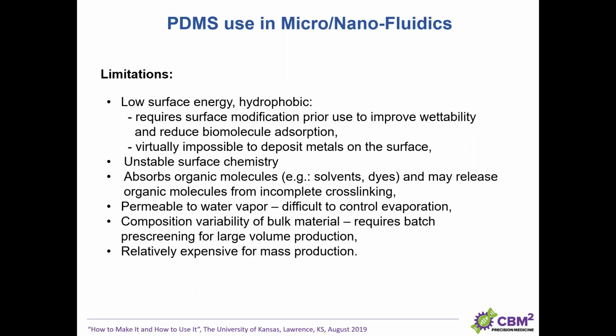It is permeable to water vapor, so in the previous slide I gave you this as an advantage, but it also can be a disadvantage if you try to control the evaporation from the chip. It's not that simple.